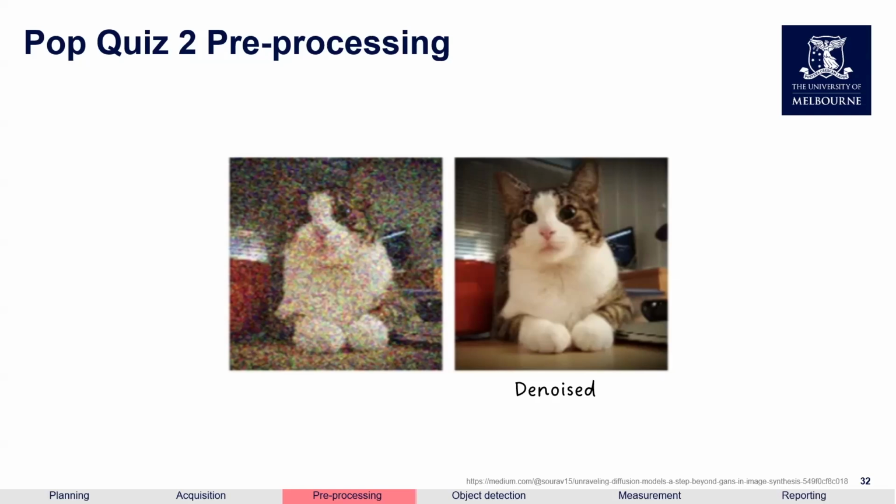The third answer is relatively easy. If deconvolved, it will increase the resolution, yes. And I've also given you a couple of examples of how we can correct the background illumination. In terms of increasing bit depth, if your images were taken at 8 bit and you try to increase to 16 bit, it's not going to add more details.